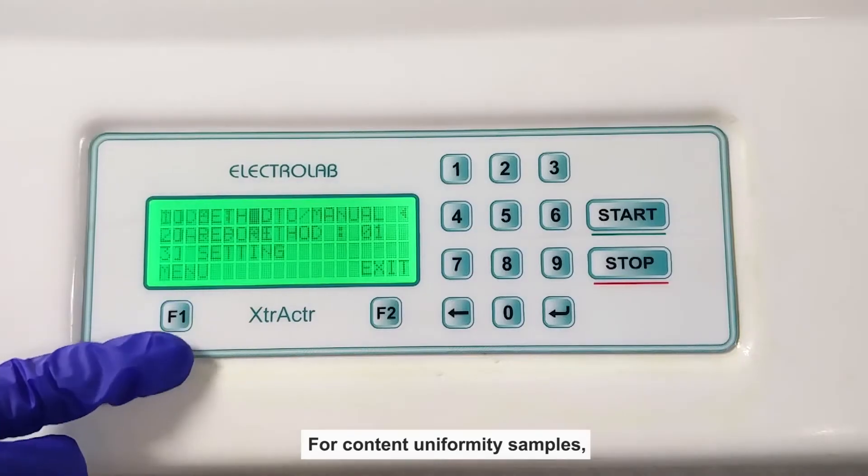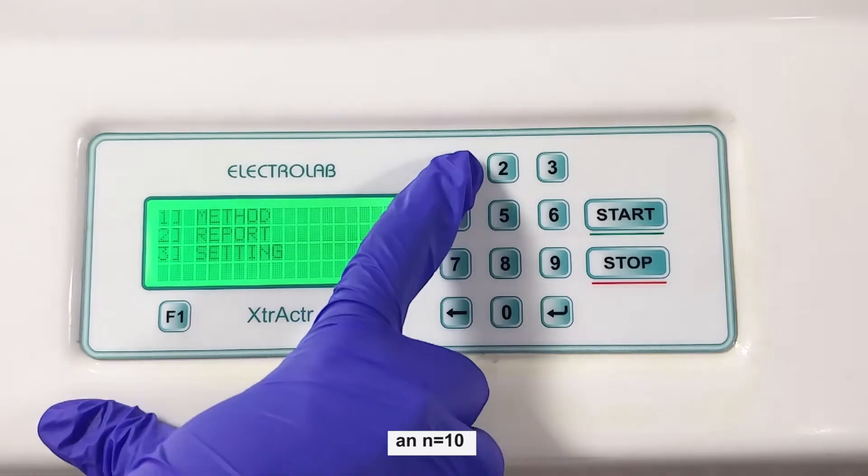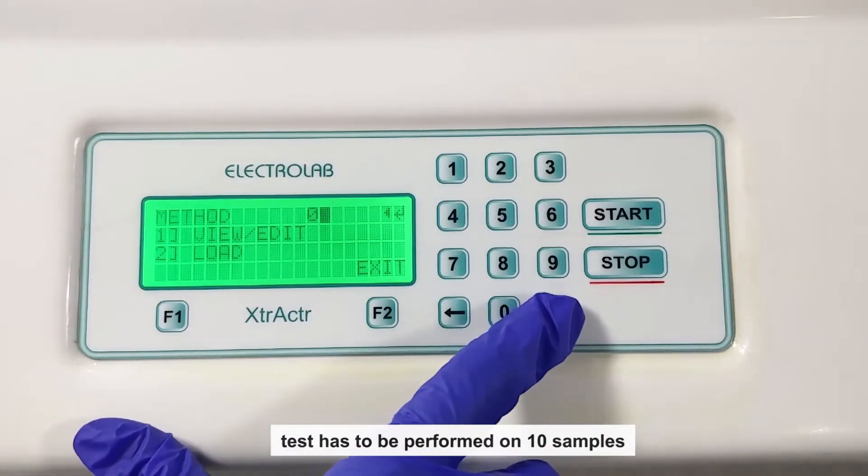For content uniformity samples, an N equals 10 test has to be performed on 10 samples.